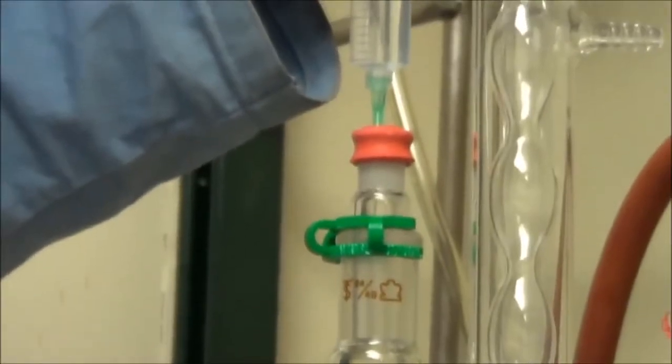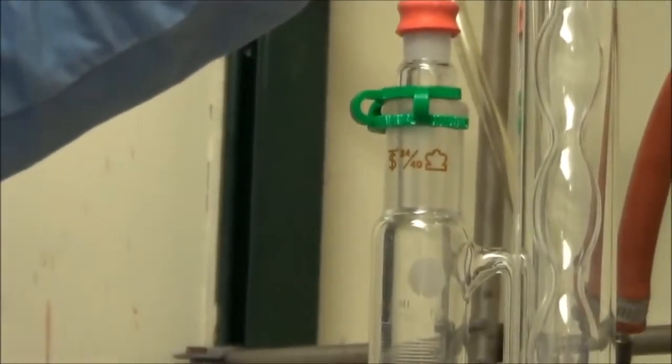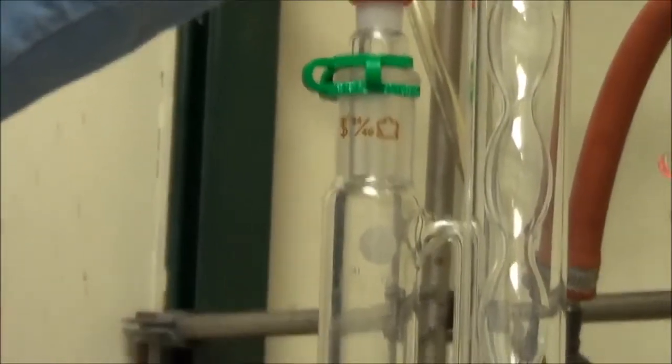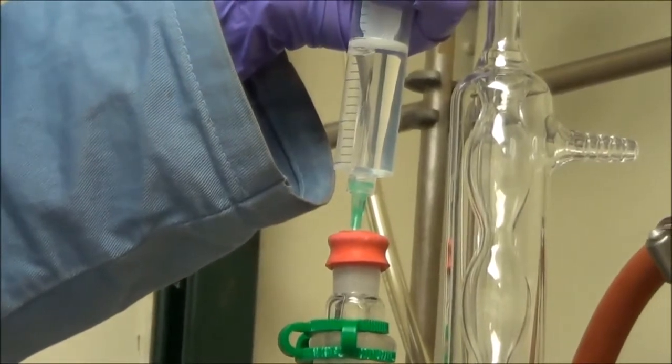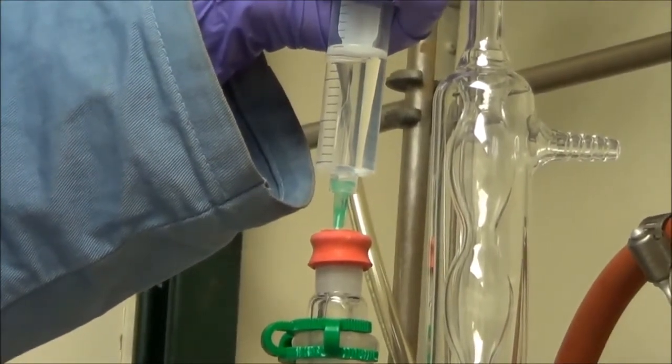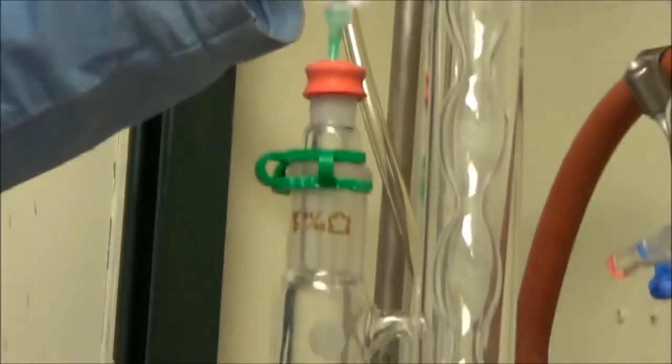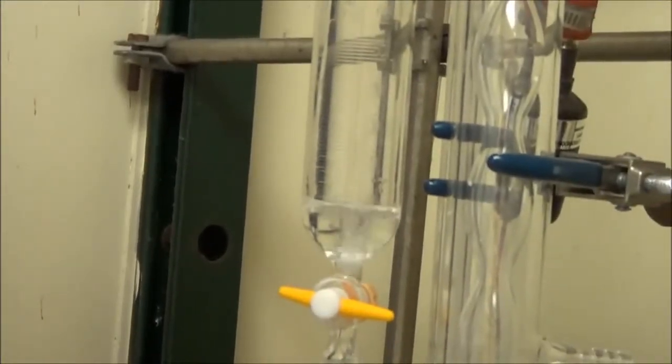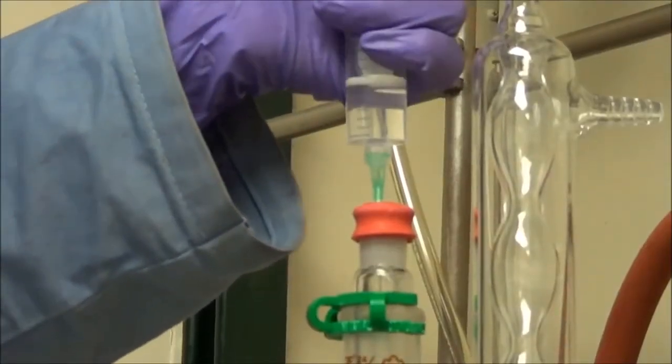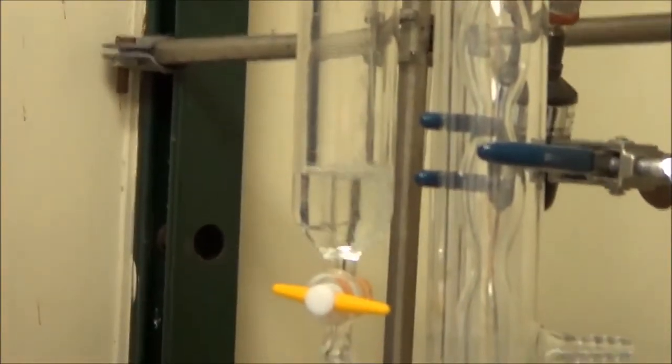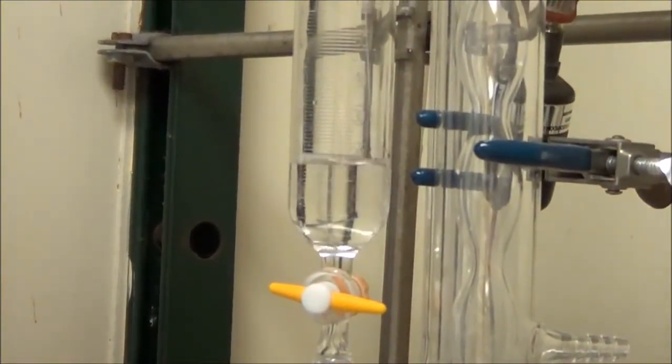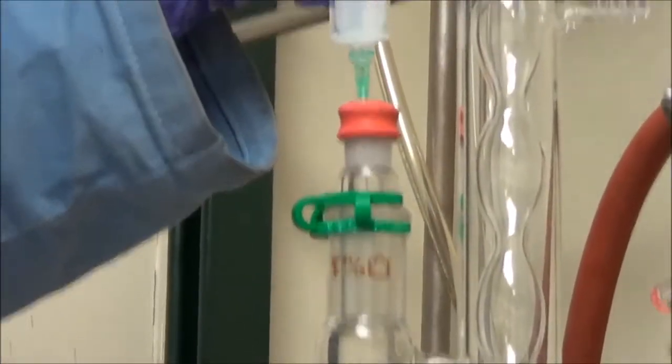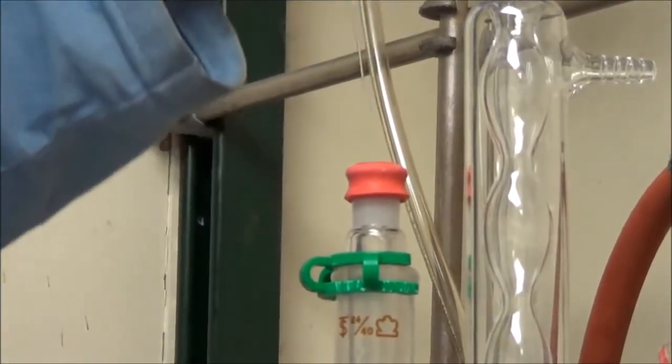The next step is to add the bromotetradecane, and again, we're going to do that through the septum in the addition funnel. This material is like molasses, so it's actually slightly easier to get it to drip in slowly, but it takes a little bit longer to inject into the addition funnel. We're going to add this in several portions, because we're actually adding a lot of material at once, so we just fill up the addition funnel, drip it in, and then recharge it.